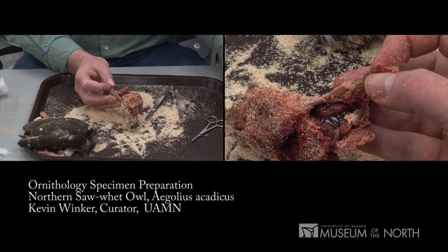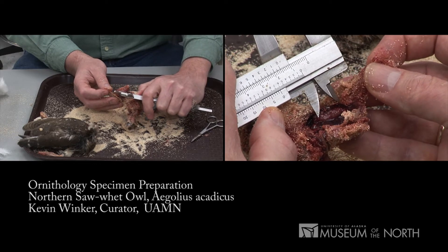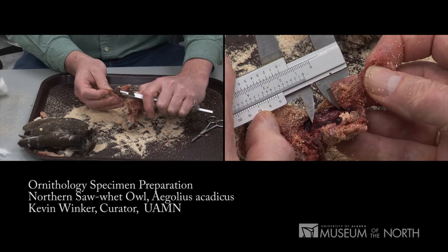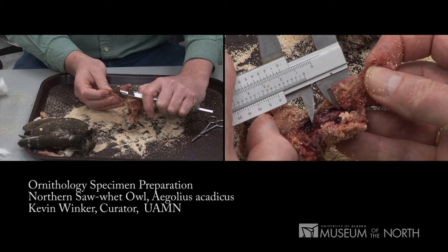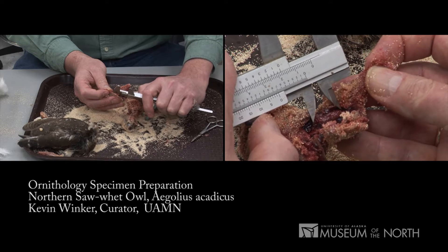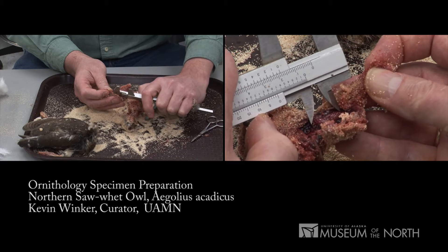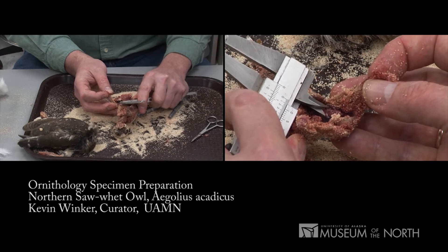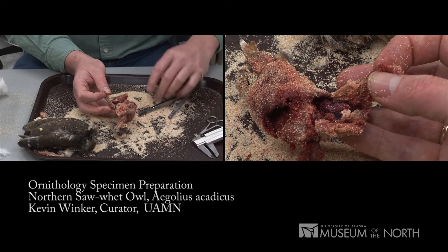What we also do is measure the organs themselves. Birds tend to have only one ovary — they'll have two testes. Most birds have that single ovary on the left side, which is why we go in from the left. So I'll measure the length of the ovary and its width. It's 18.5 by 5.8.